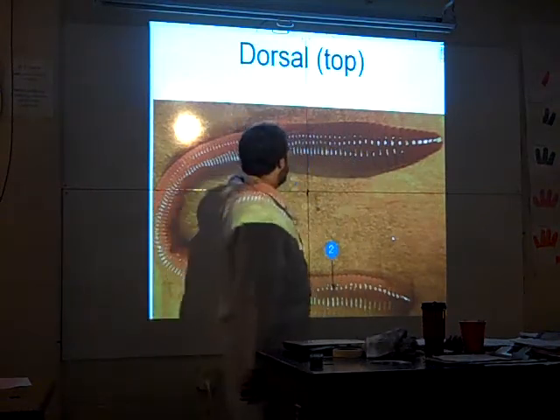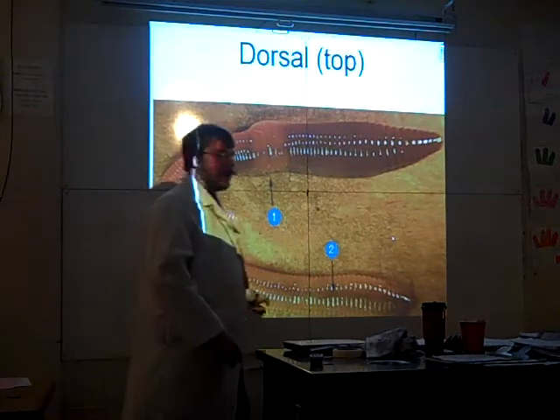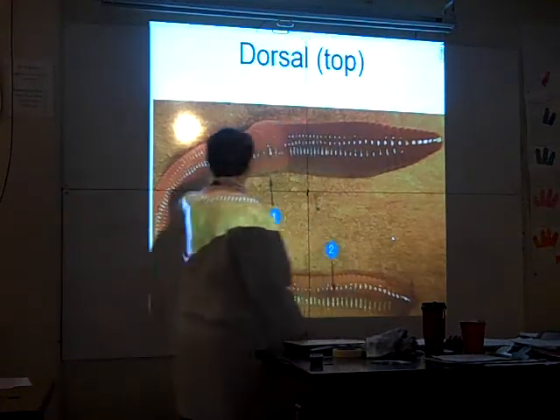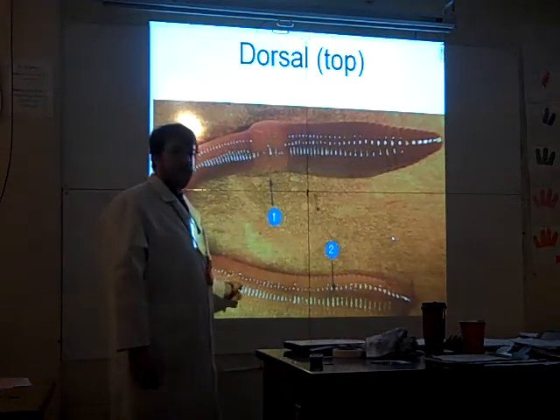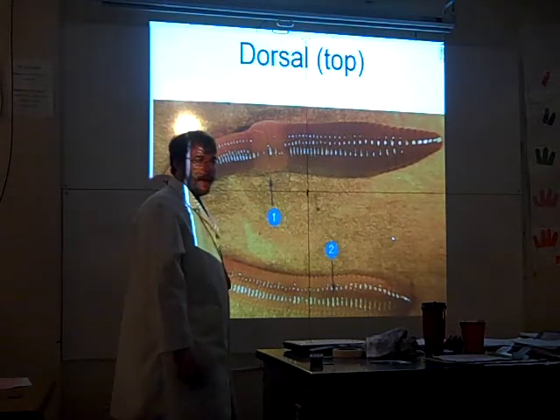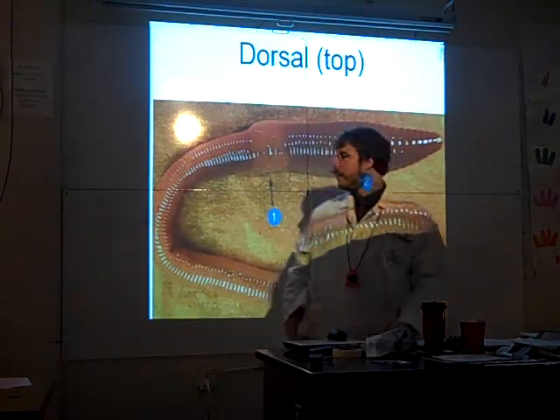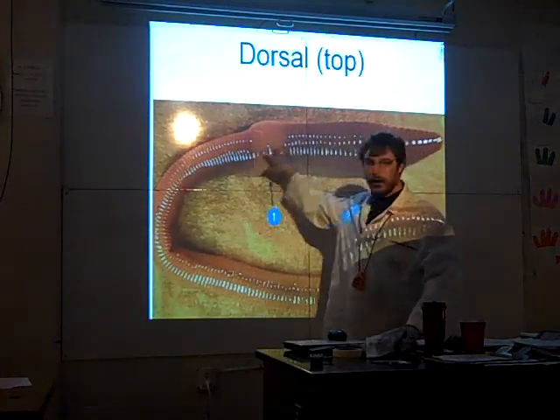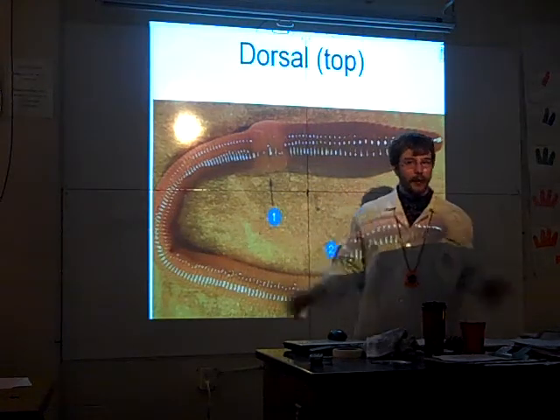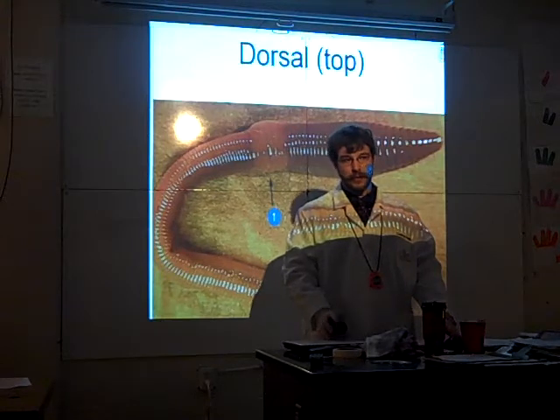Your dorsal side. Listen, on the worm, the dorsal side is the darker side. It's darker because right up the side has a blood vessel. Down here, you may even see the blood vessel. You see a thin black line? That's the blood vessel. It's full of blood. You're most likely going to nick it when you open it. Don't worry about it. When you get down to here, if you see a whole bunch of black goo, then you're way too deep with the scalpel. You need to pull up a little bit because you're cutting its intestine open.